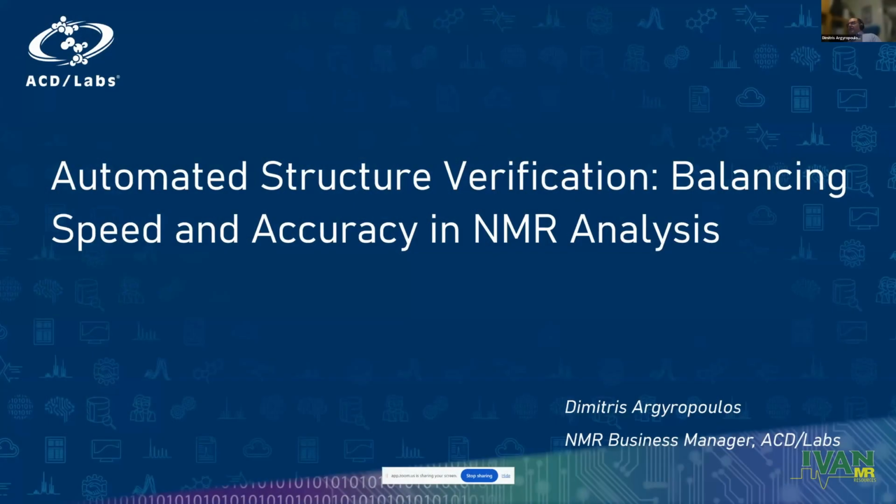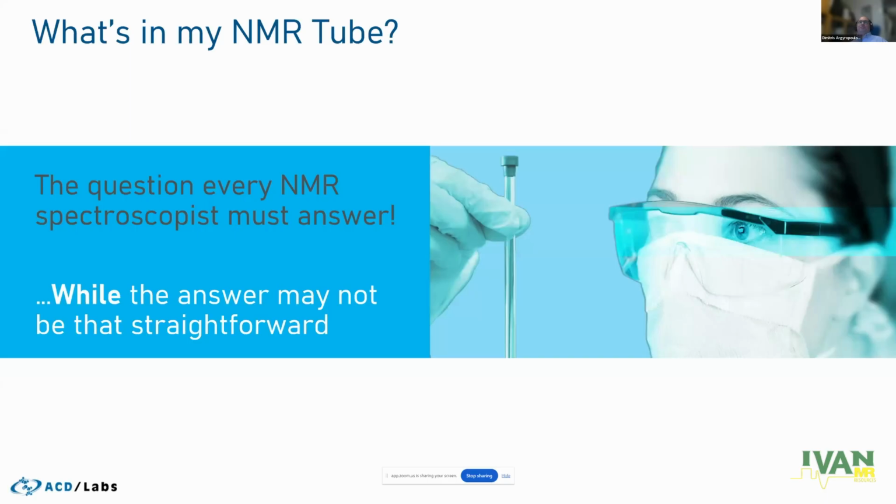Thanks a lot, Dave. So yes, we will be discussing automated structure verification today and balancing speed and accuracy in NMR analysis. The main question that we have to answer as people working with NMR is, what's in my NMR tube? And the answer sometimes may not be that straightforward. So let's see what we have and what we can do.